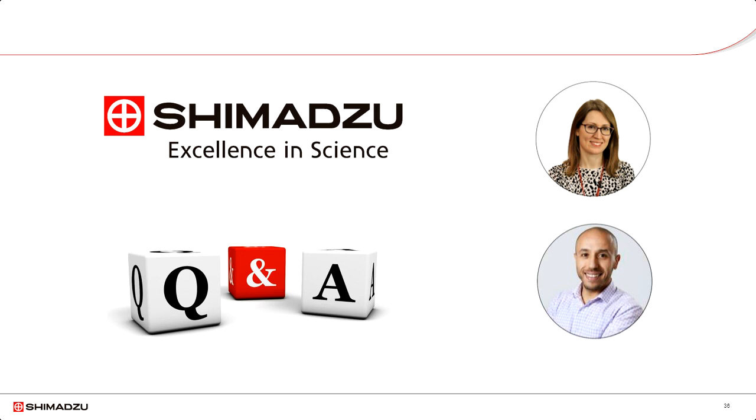That's a very good question, actually. Oh, absolutely. We can automate large sample numbers. We can do this in the main acquisition software, or we have a dedicated automation software that simplifies the acquisition of large sample numbers when, for example, you're using the same method. We also have a specialized automation software, but that's for targeted QC analysis.